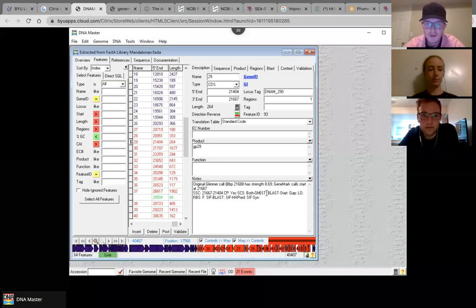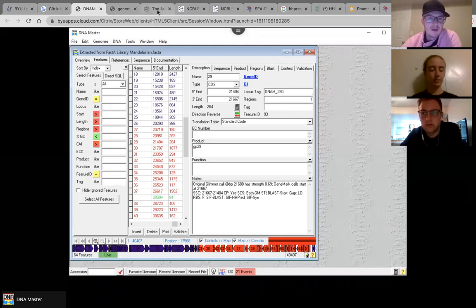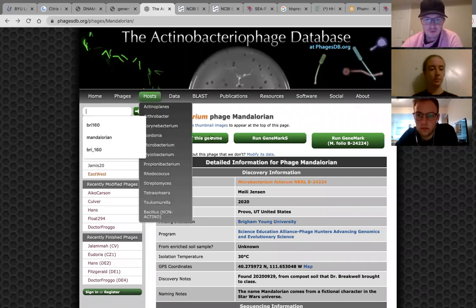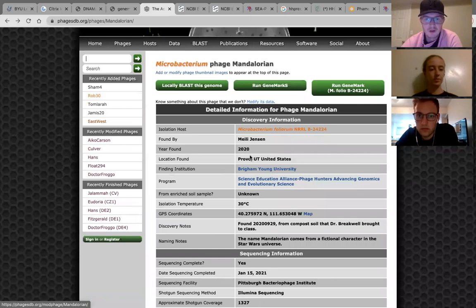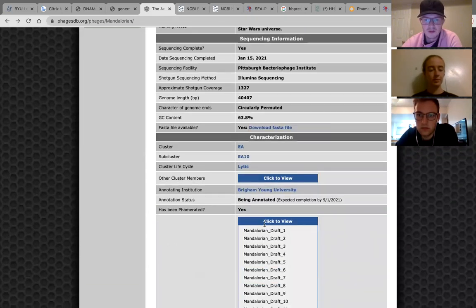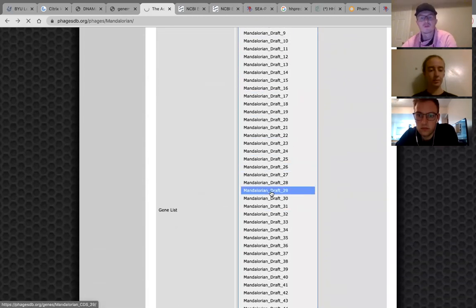Okay. Then next thing we have is Starterator. If you remember, to get to Starterator, we have to use PhagesDB, my bad. You type in Mandalorian, or whatever phage you're working with, and you go down here to gene list. You click to view, and we are looking at gene 29. So we will go to gene 29 here, and that will open up another page.